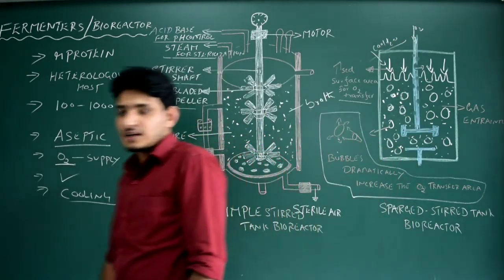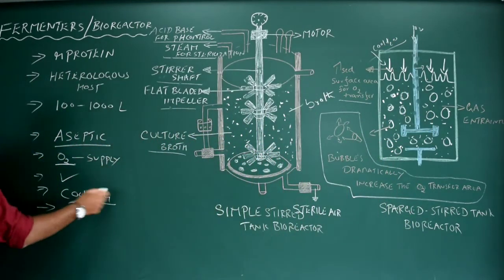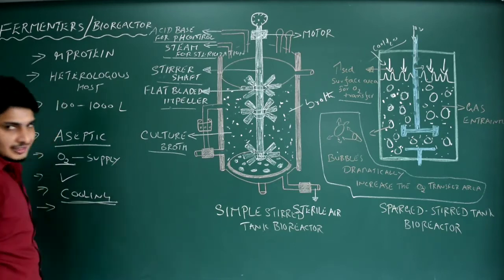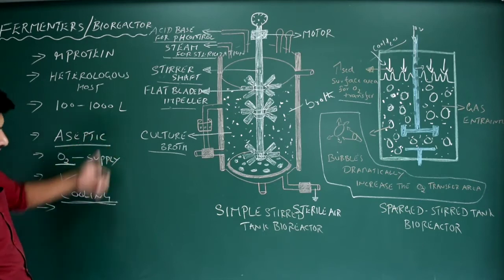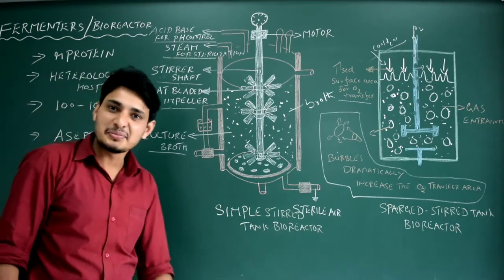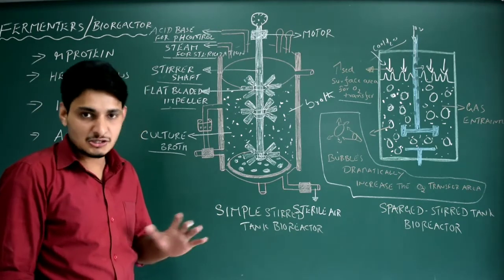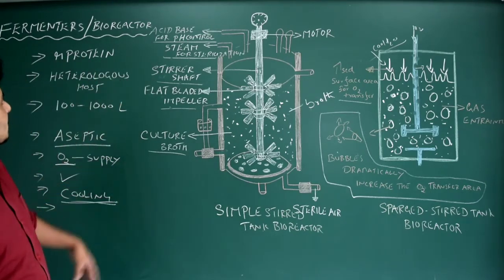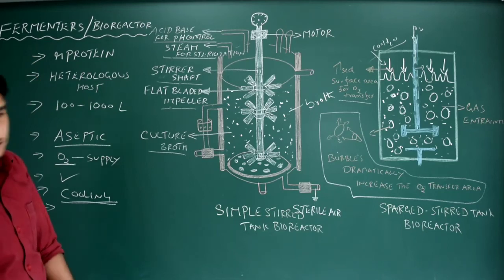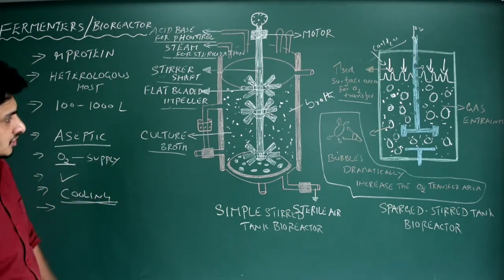So this is the thing. Supplying the cool water, that is cooling of the vessel, is very challenging. So these four steps have to be done every day. Maintenance is not that easy. Got it? So this is a bit of introduction about biofermenters or bioreactors. Enough actually, it's more than sufficient.